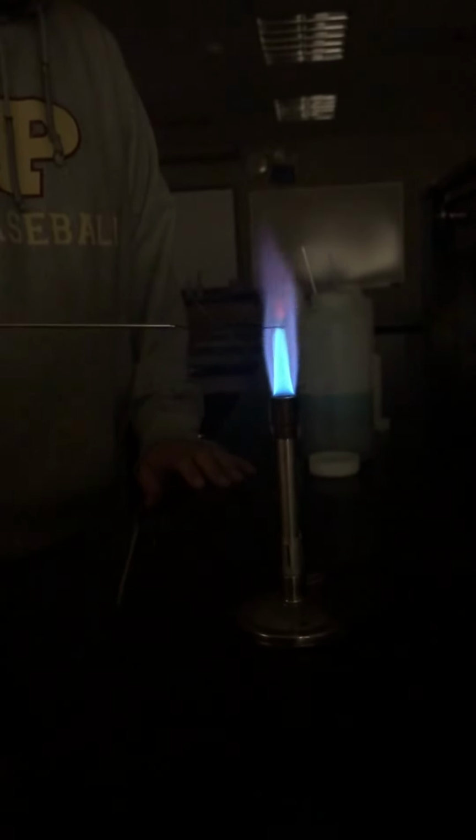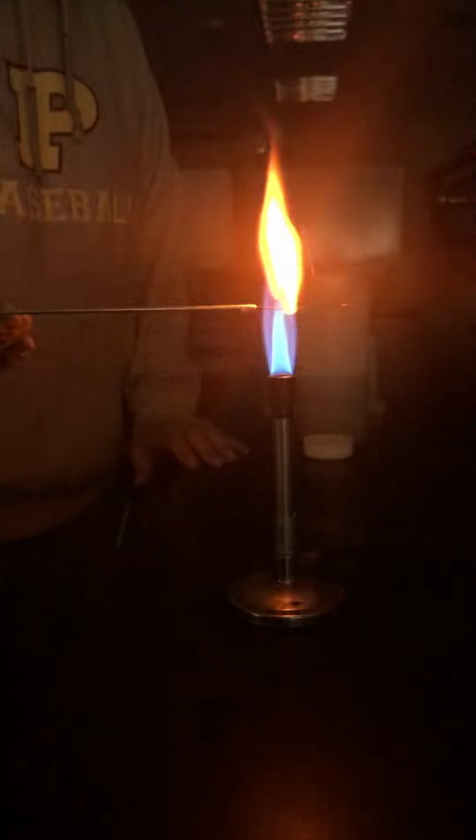You may not notice the difference between the two, but sodium, remember, iron was a gold, or it should have been a gold. This was really good. As you can see, that bright yellow right there. And I go all the way down, bright yellow. Really good. All right. So sodium is bright yellow.